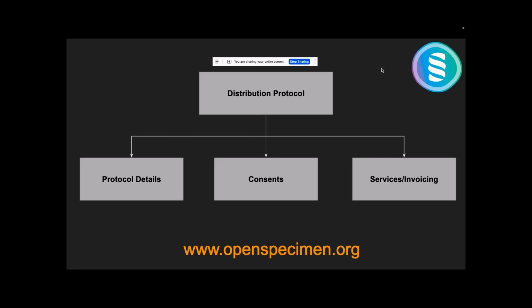And thirdly, it is called services and invoicing. Whenever you send any specimens to a researcher, he might also ask for some additional tests, for example, histology, pathology, and that kind of services, or even DNA extraction and so on. With that, you also have an option to document these services. You also have an option to generate invoices and download these invoices for your internal purposes. So all these things can be done within OpenSpecimen.